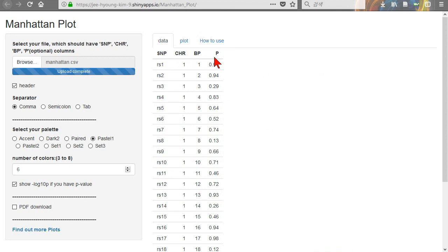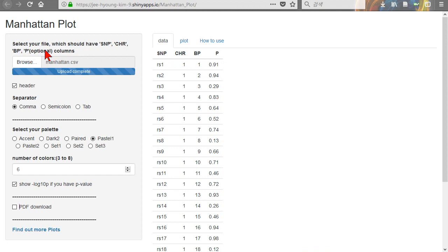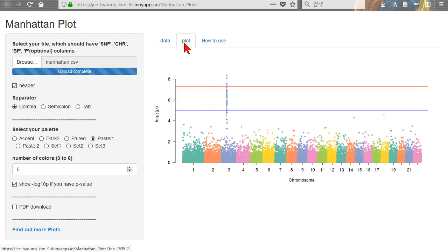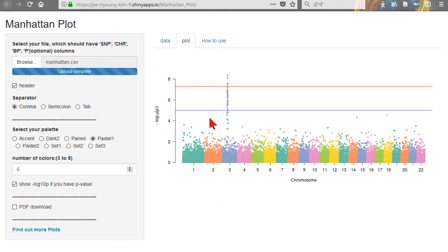This field name is specific — you should follow it. The P field is optional. You can click Plot. It is very simple. There are a few options available.